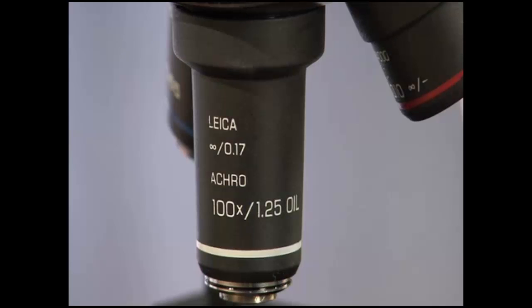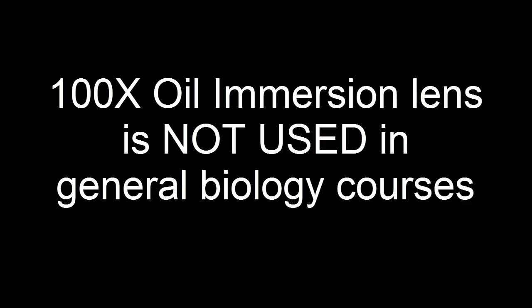There is one more objective, the 100x oil immersion objective. This video will not demonstrate the use of this objective as it requires special immersion oil and is not used in our general biology courses.